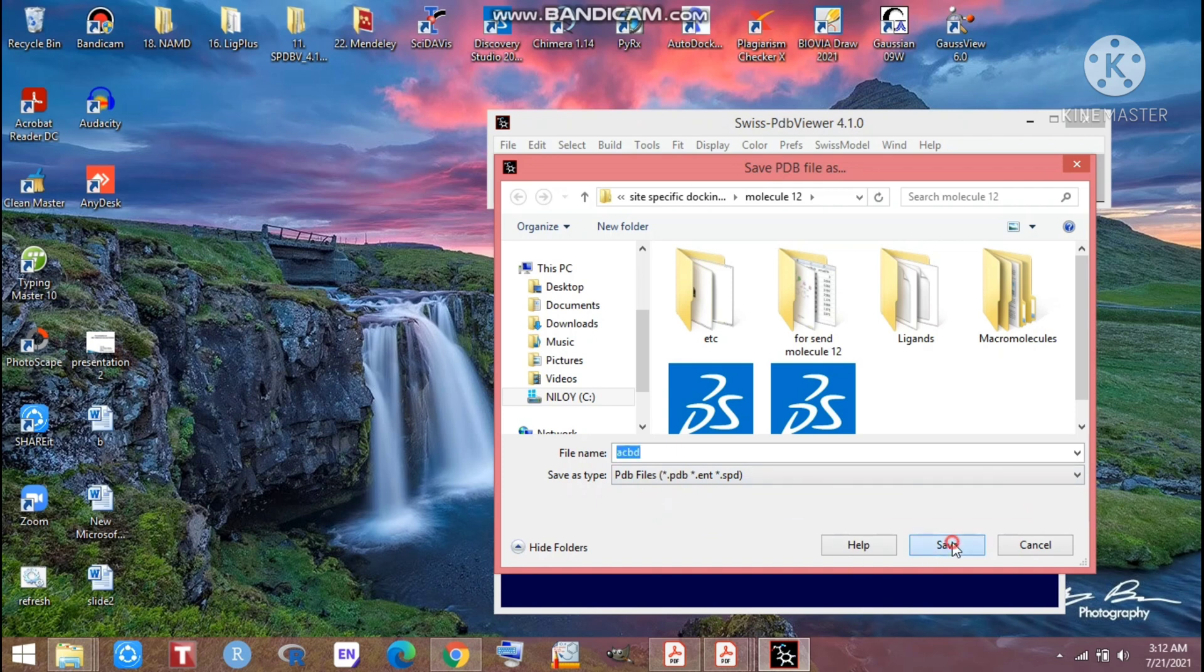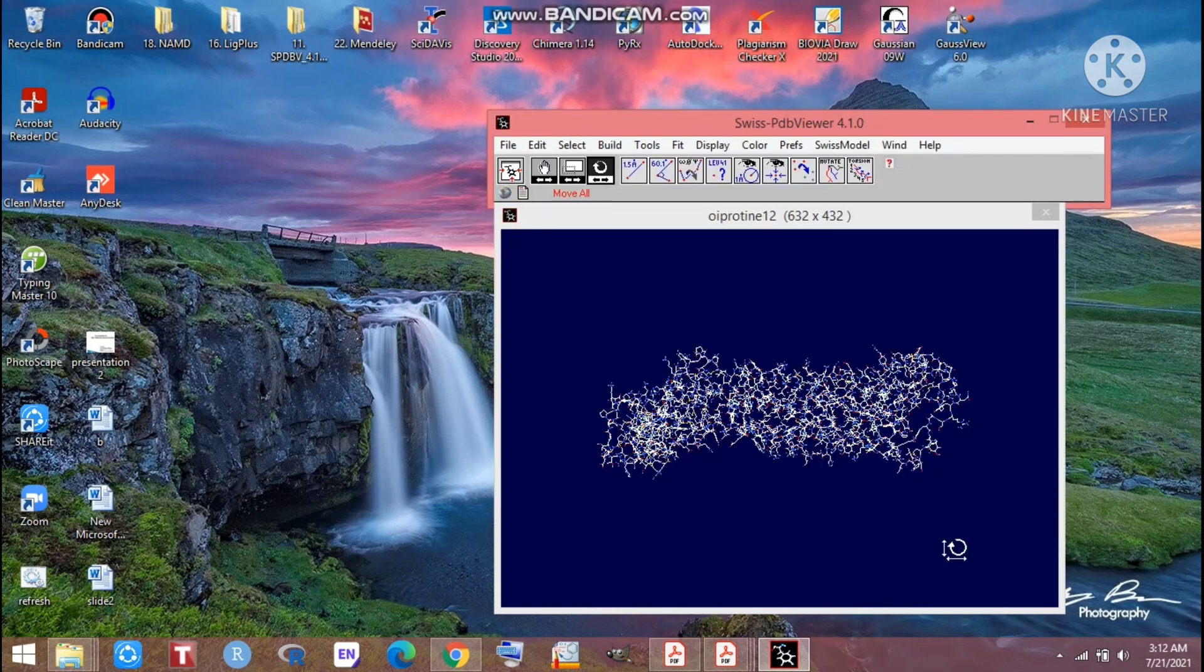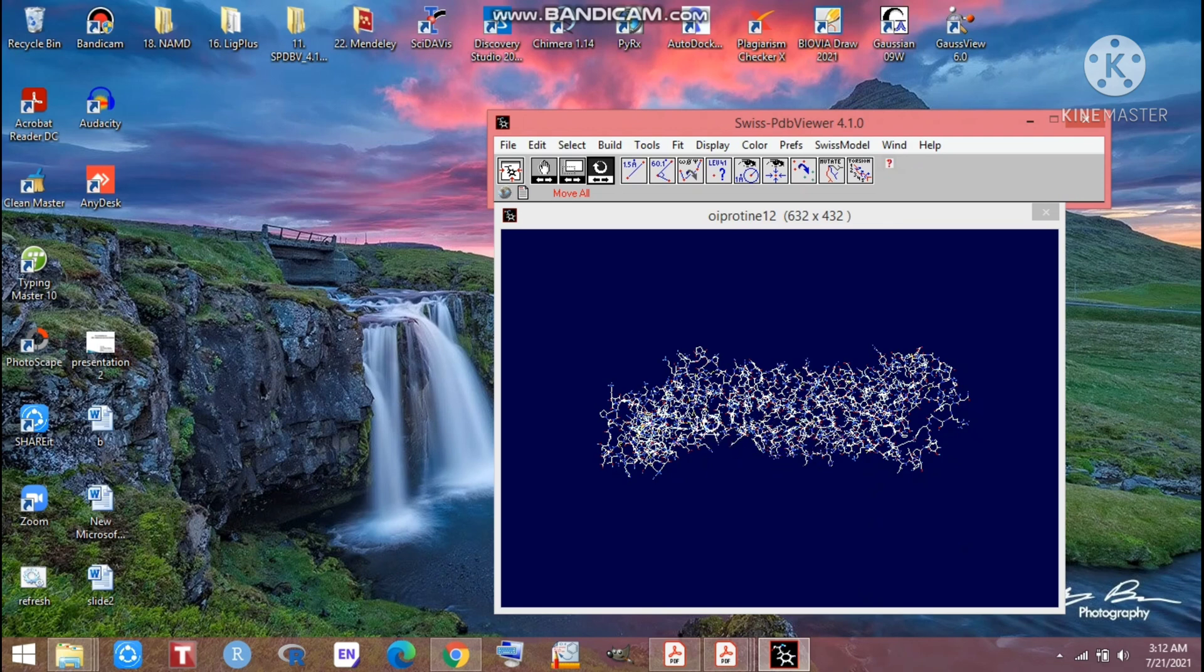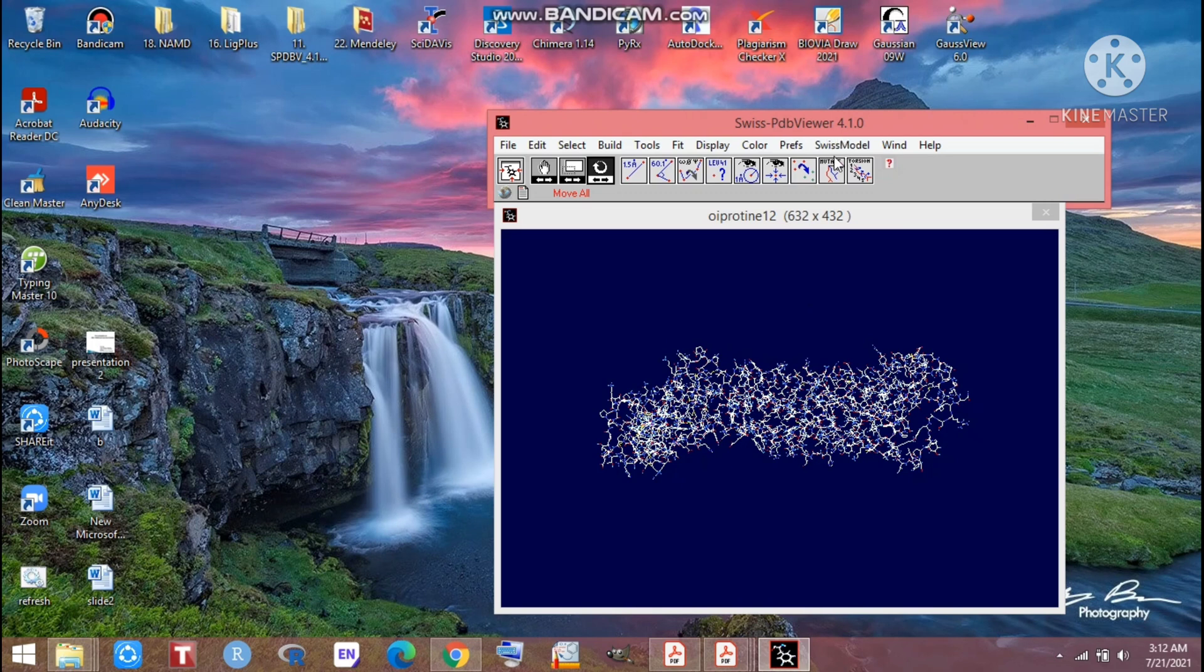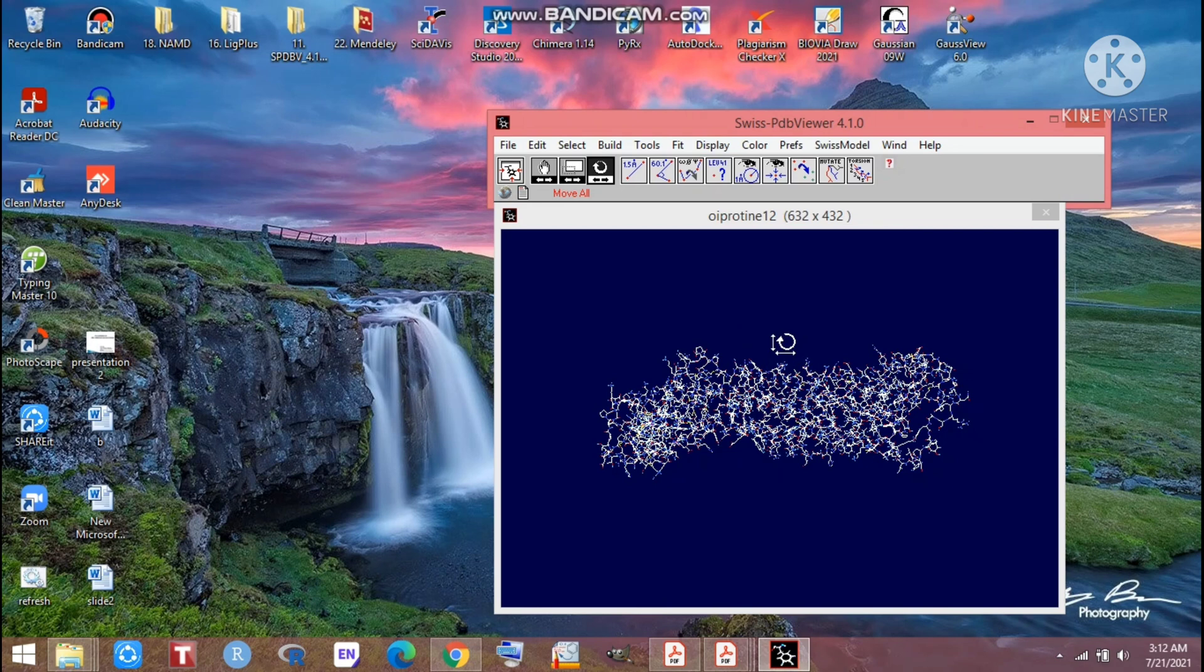You can easily get the minimized protein which wasn't minimized before. So now we have the minimized protein through working on this Swiss PDB viewer. When you will go for docking, before docking you have to prepare your protein. At that time you can easily minimize all the energy of your desired protein through Swiss PDB viewer.